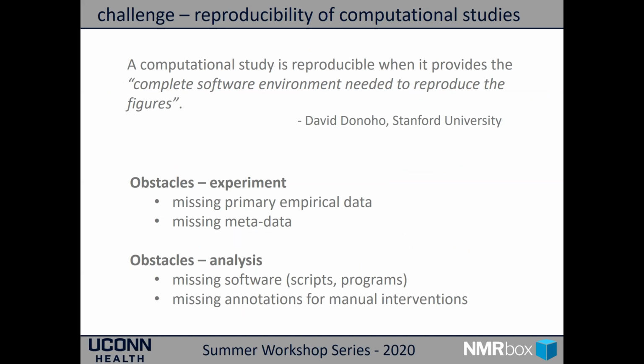There might be missing primary or empirical data. The software, the scripts, the programs, or annotations might be missing. NMRbox cannot solve all of these types of reproducibility obstacles, but we can at least address the software reproducibility and the persistency of the software itself. So at least the software that was used in studies that are being published now will be able to be executed again in the future.